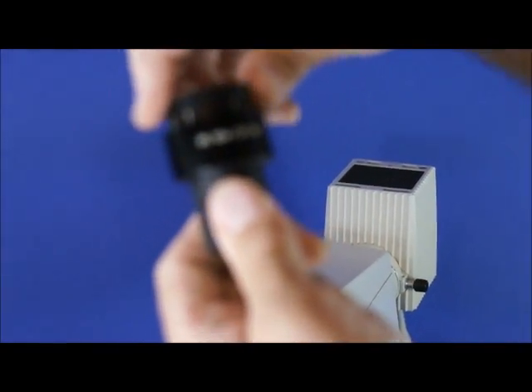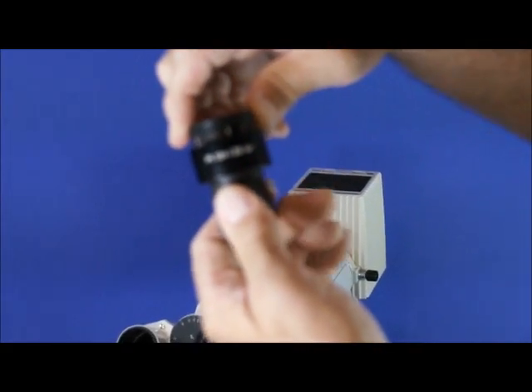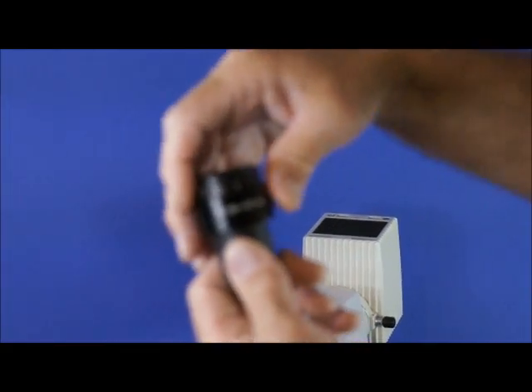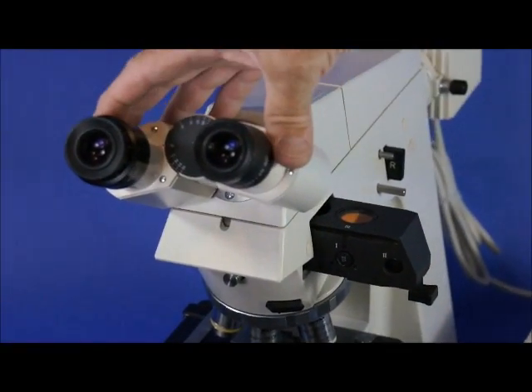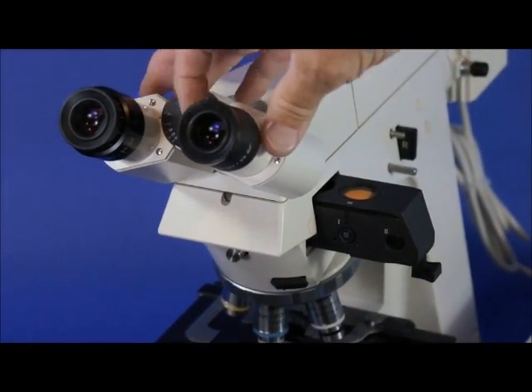And it's got on the left side a focusable diopter eyepiece. It's a PL10X, 20 field number, accommodated for eyeglass wearers. And so you can accommodate different visual acuities and remain parfocal.